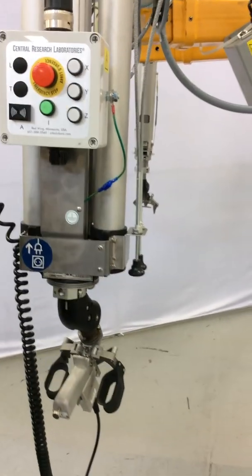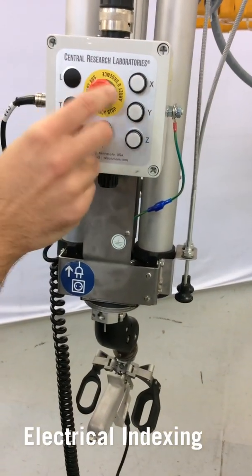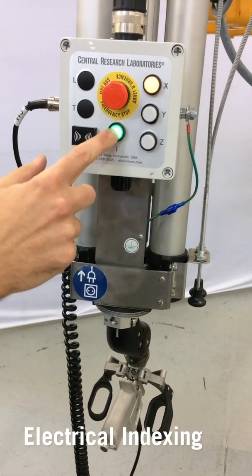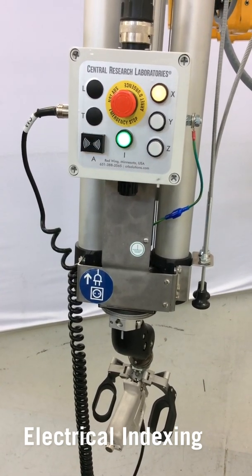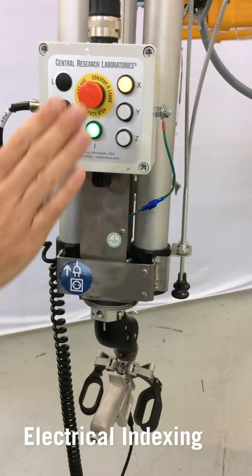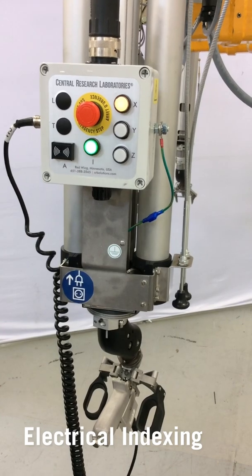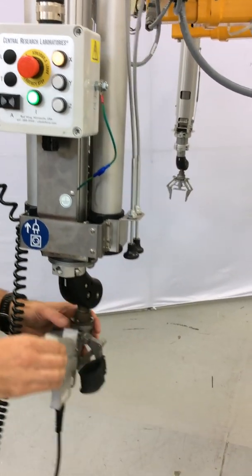For electrical indexing operation, make sure that it is plugged in and the e-stop is out and disengaged. Depress the green button. When that light is on, the indexing is ready.